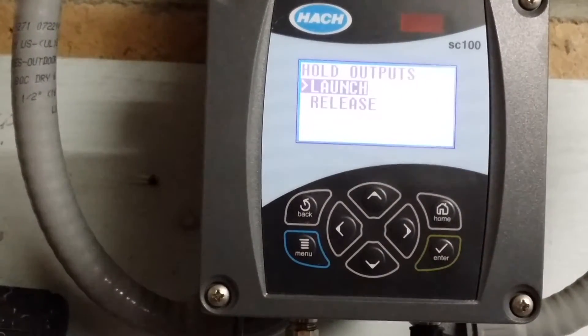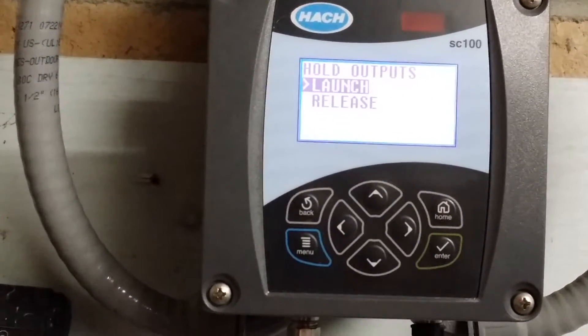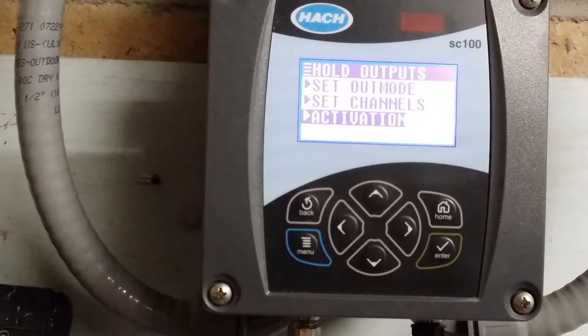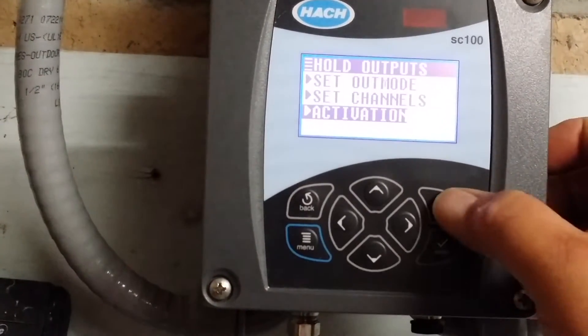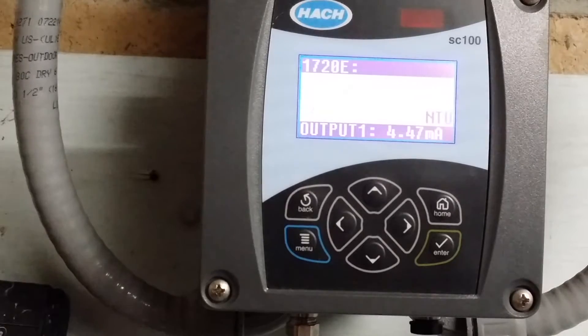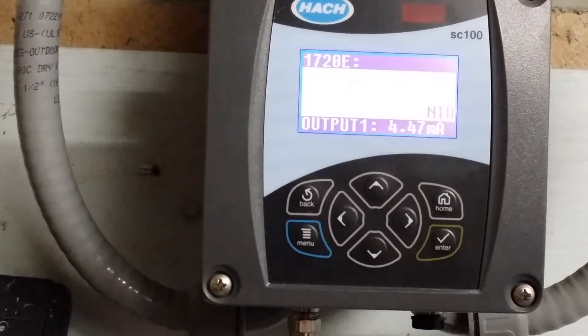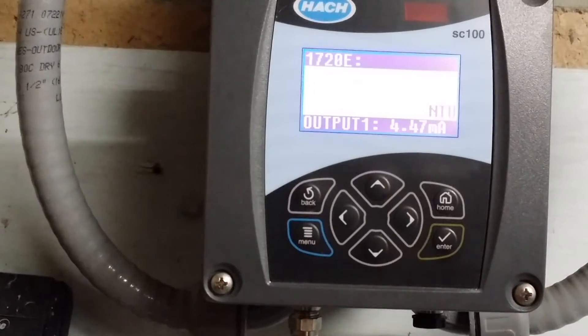At this point you will see it automatically highlights the launch mode. Launch means it will hold the outputs. At this point we hit enter. After we've done this we will go back to the home screen and your readout will now be flashing, confirming that you are in the hold outputs mode.